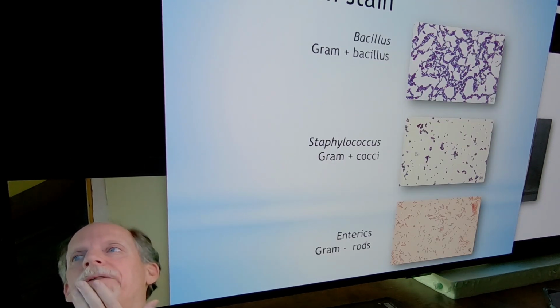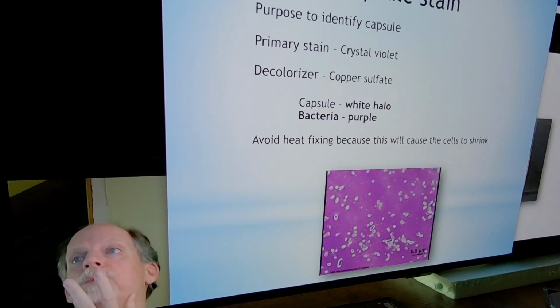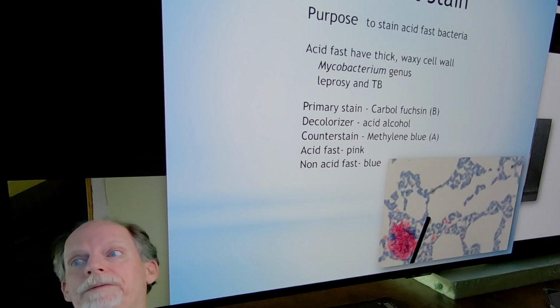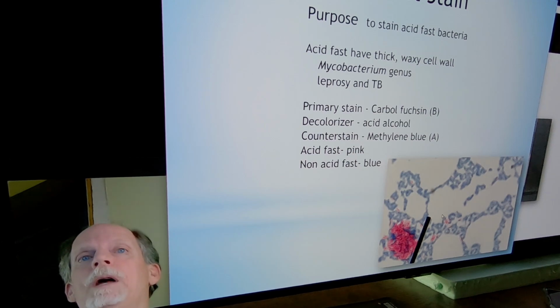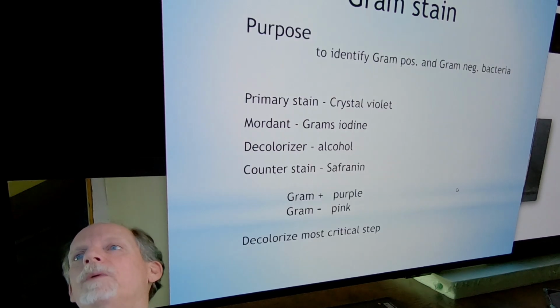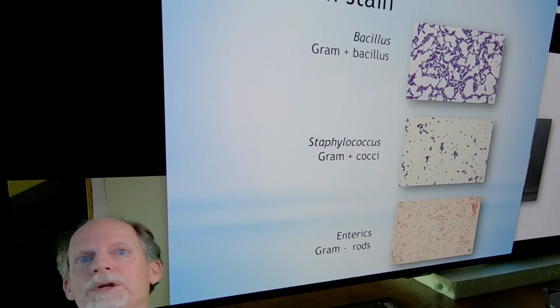The gram stain, right, will be one color. I tell students there won't be 2 colors. Whereas if you do the acid fast, if it's a microscope or if it's this image, you can tell the difference because on the acid fast you have pink and this blue color, where on a gram stain there won't be 2 different colors.